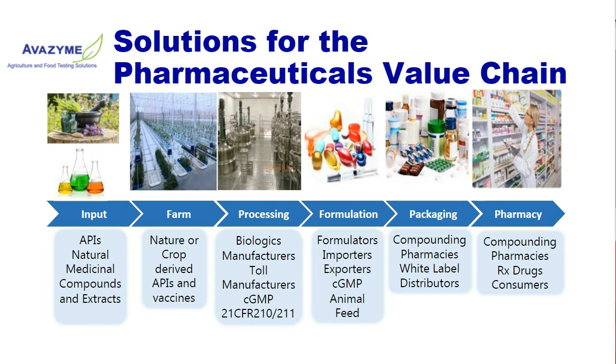It's very important that the heavy metals are monitored in the crop that is used to make these vaccines, because you don't want heavy metals to get into your body through the vaccine product. So this particular client makes very sure that there are no detectable levels of heavy metals in their crop.